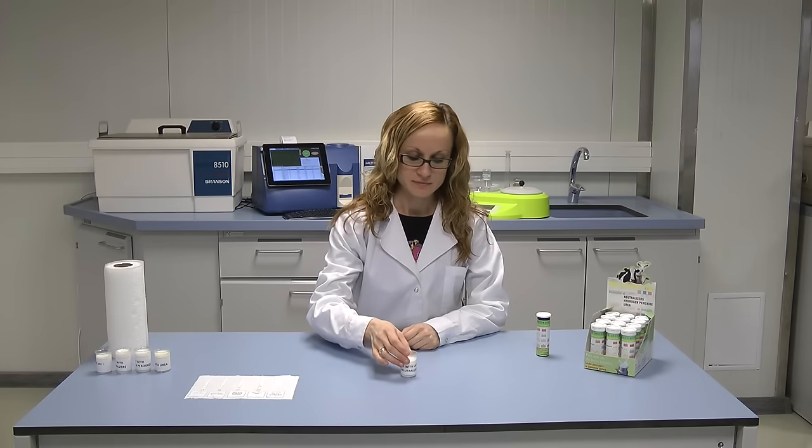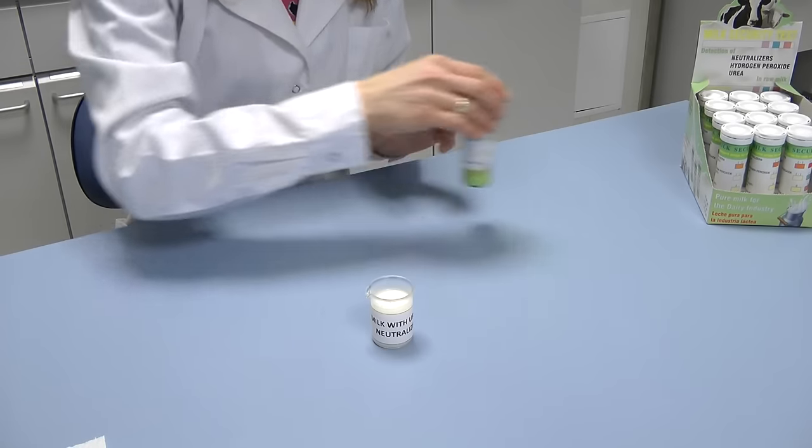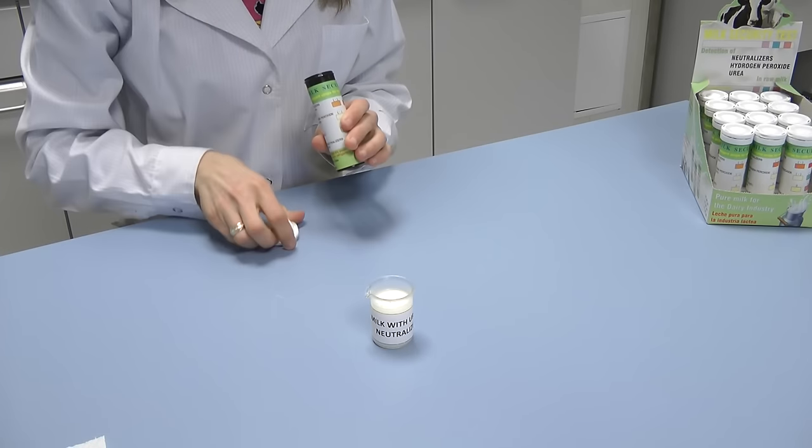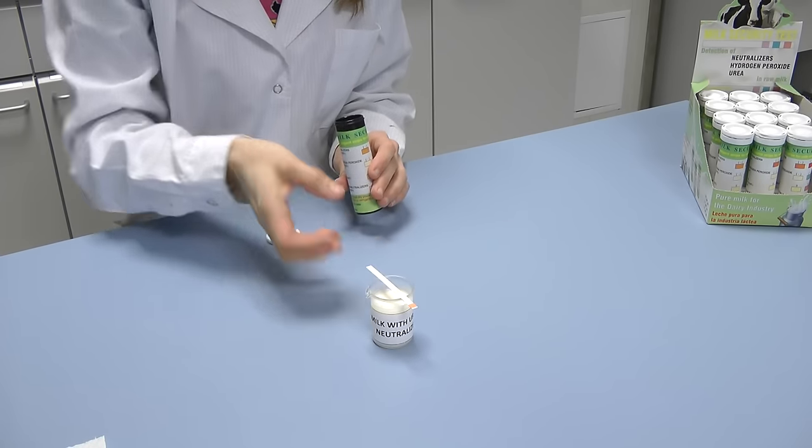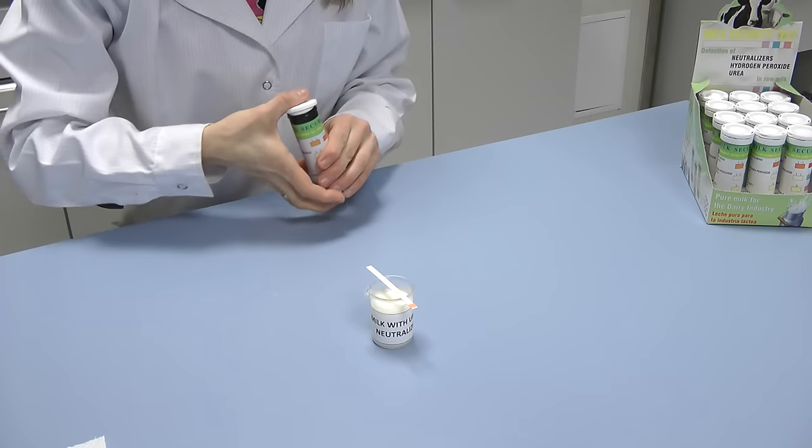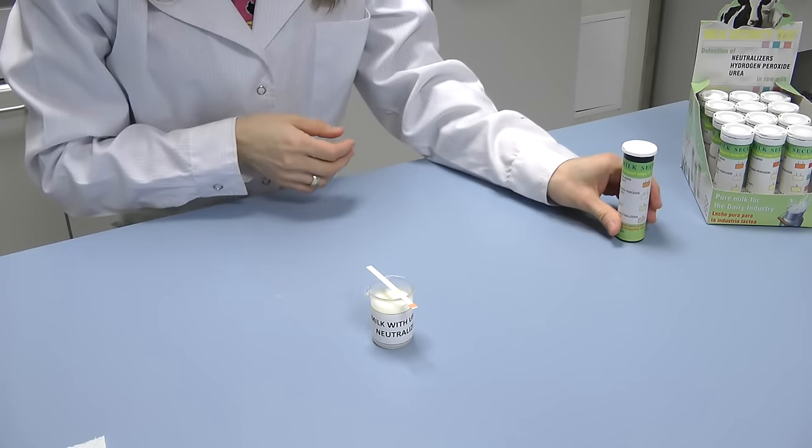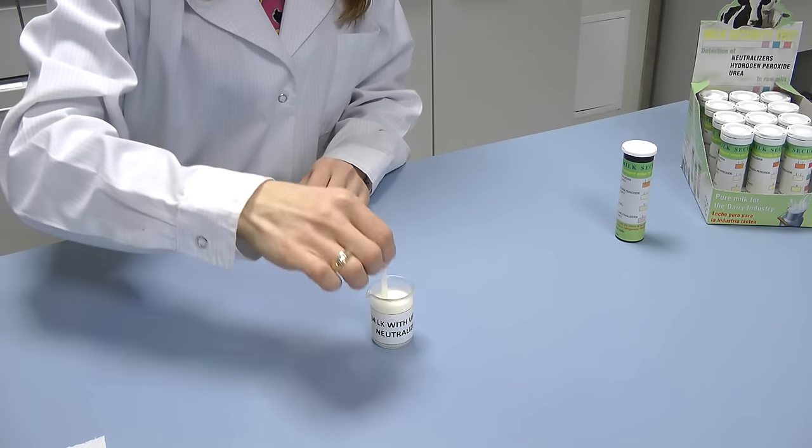Fifth sample is milk adulterated with neutralizers and urea. Neutralizers change the color of the indication area of urea. In case a positive result for neutralizers is received, the urea result must be compared with the second color scale.